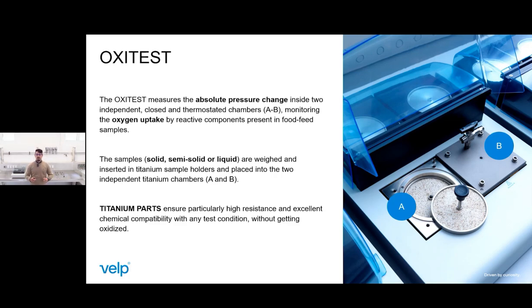Samples that can be solid, semi-solid, or liquid are placed in these titanium sample holders and then introduced into the chamber of our instrument.